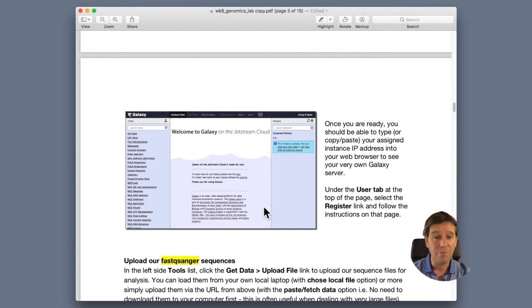But that's kind of painful, right, to start installing all that software and getting it up and running. So a great way to start our exploration, where we'll see the whole workflow, is to use a tool like Galaxy. Galaxy is really great for starting out in this field.